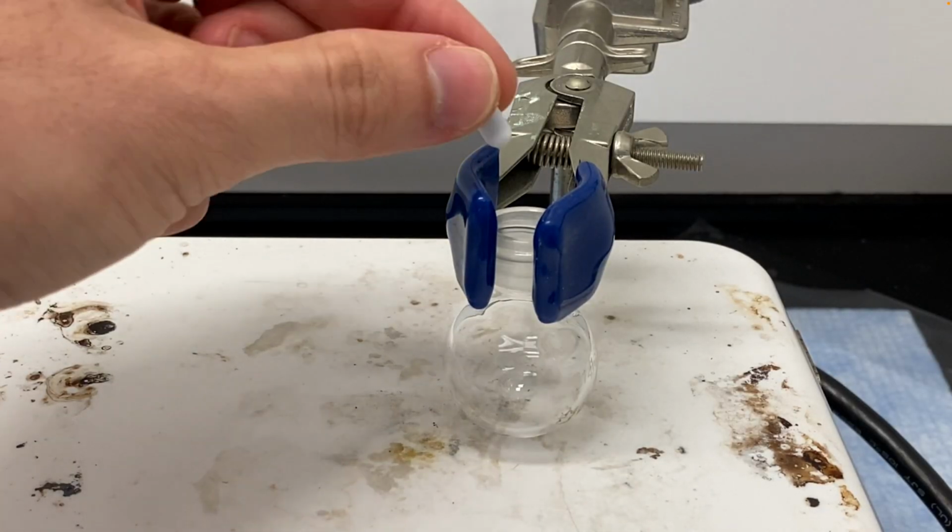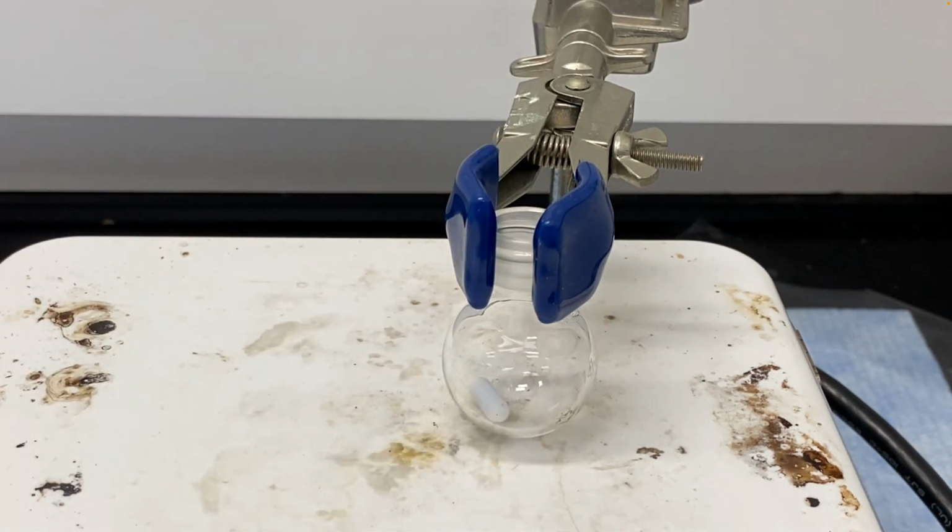Inside of the round bottom flask, to stir our mixture, we're going to use a magnetic stir bar. So we're not going to heat up our reaction at all in this experiment. The hot plate is not used to heat anything up in this experiment. It's used to stir stuff. There are two knobs on the hot plate, one for stirring, one for heating. Underneath the white top of this hot plate, there is a sort of bar magnet underneath it. And when you turn on the stirring function, the bar magnet rotates. Well, this little pill-looking thing, which is itself a little magnet, is going to line up with the bar magnet underneath the hot plate, and as the bar magnet underneath the hot plate rotates, the magnetic stir bar will rotate too, and that'll stir our solution.